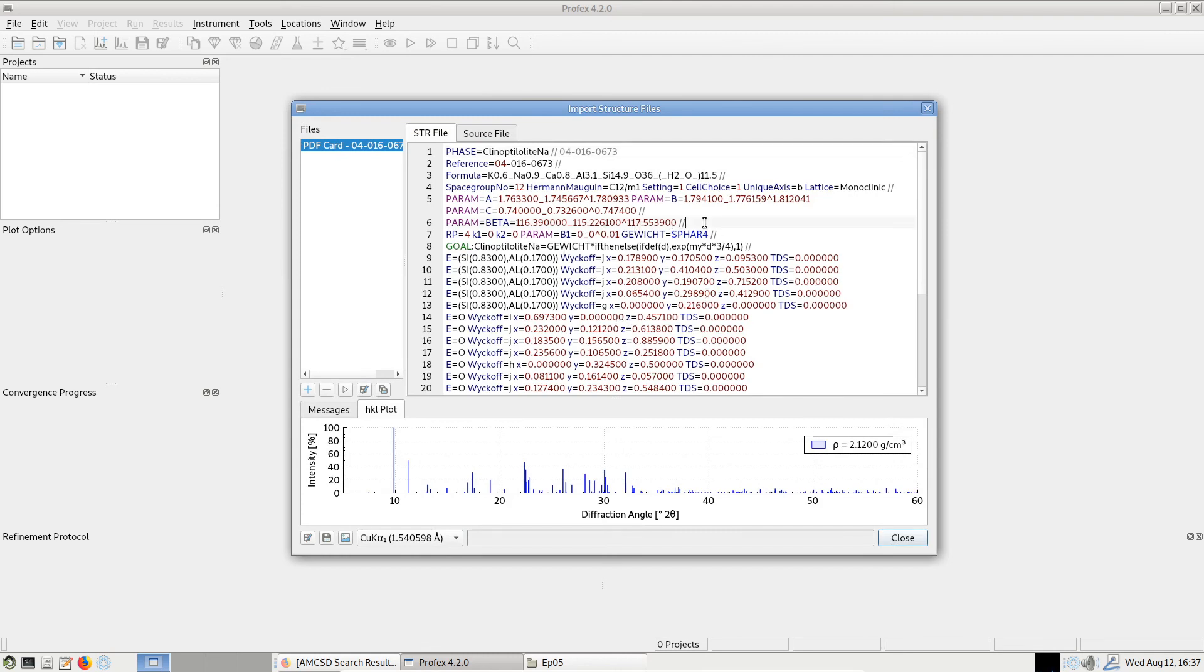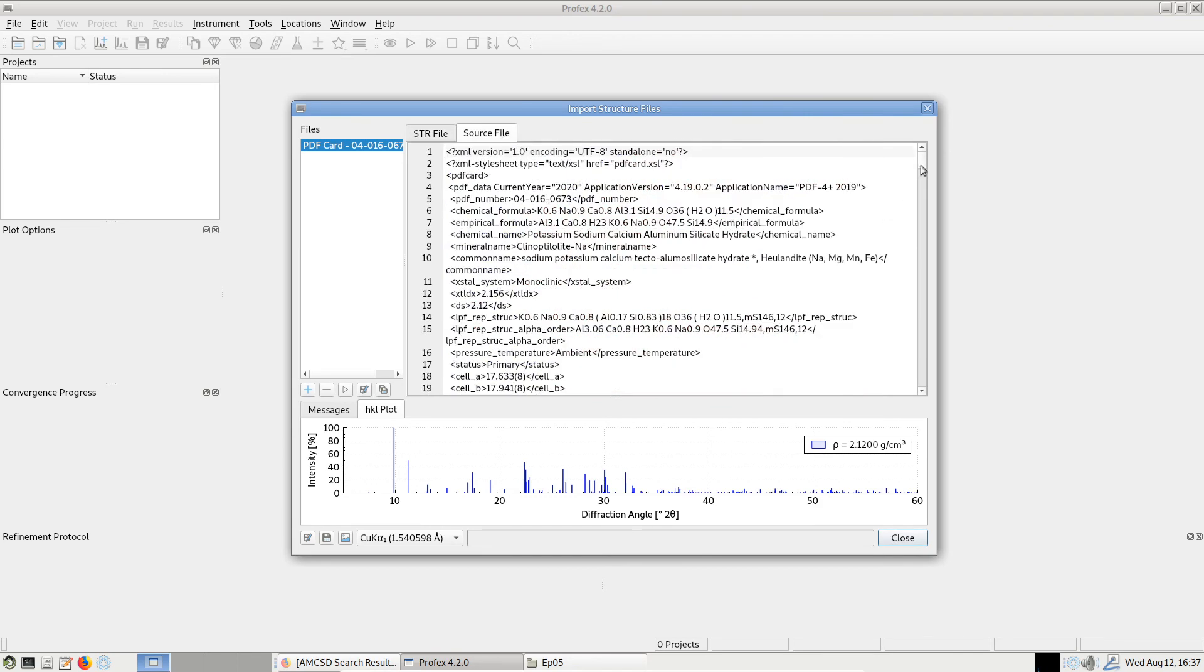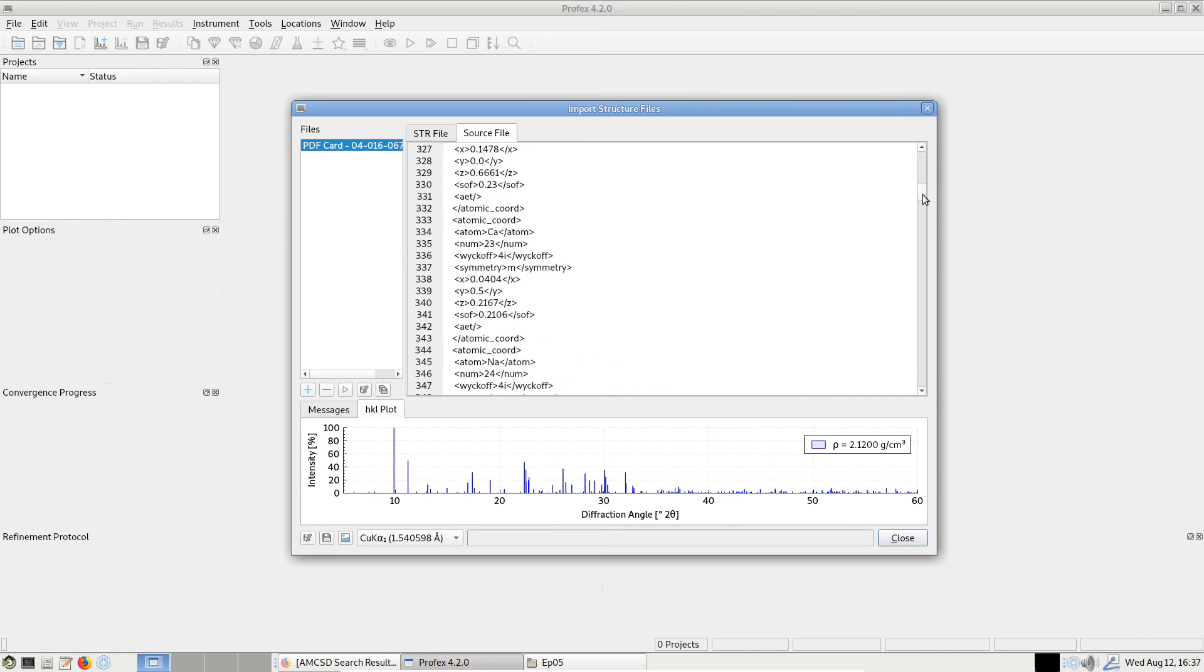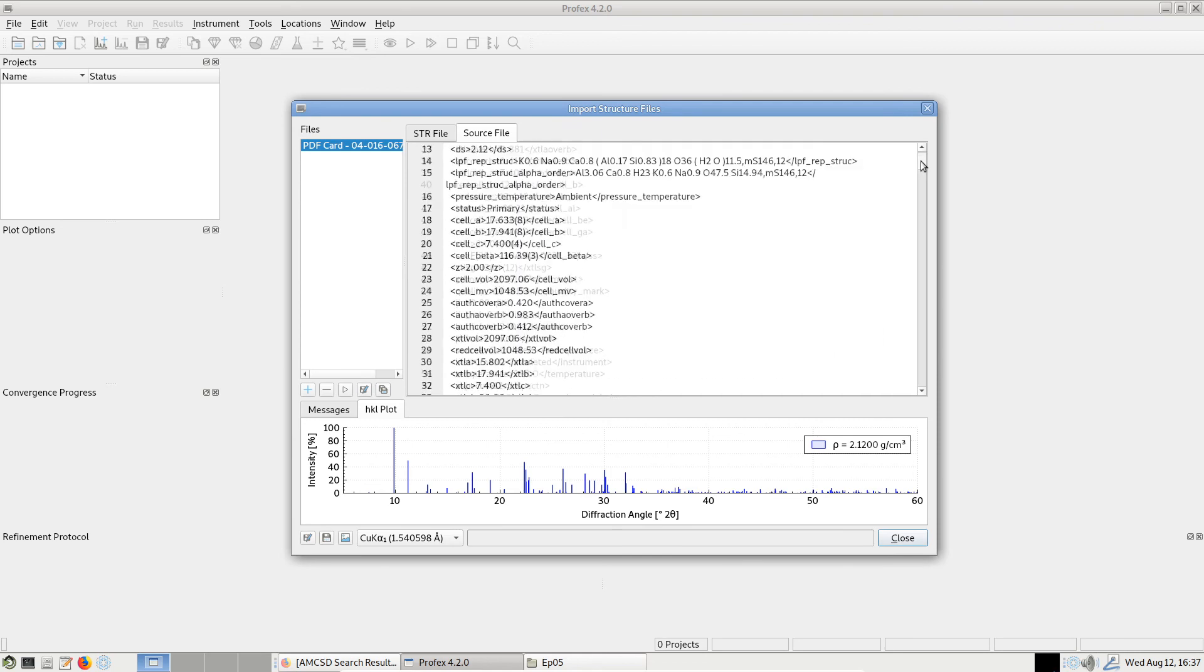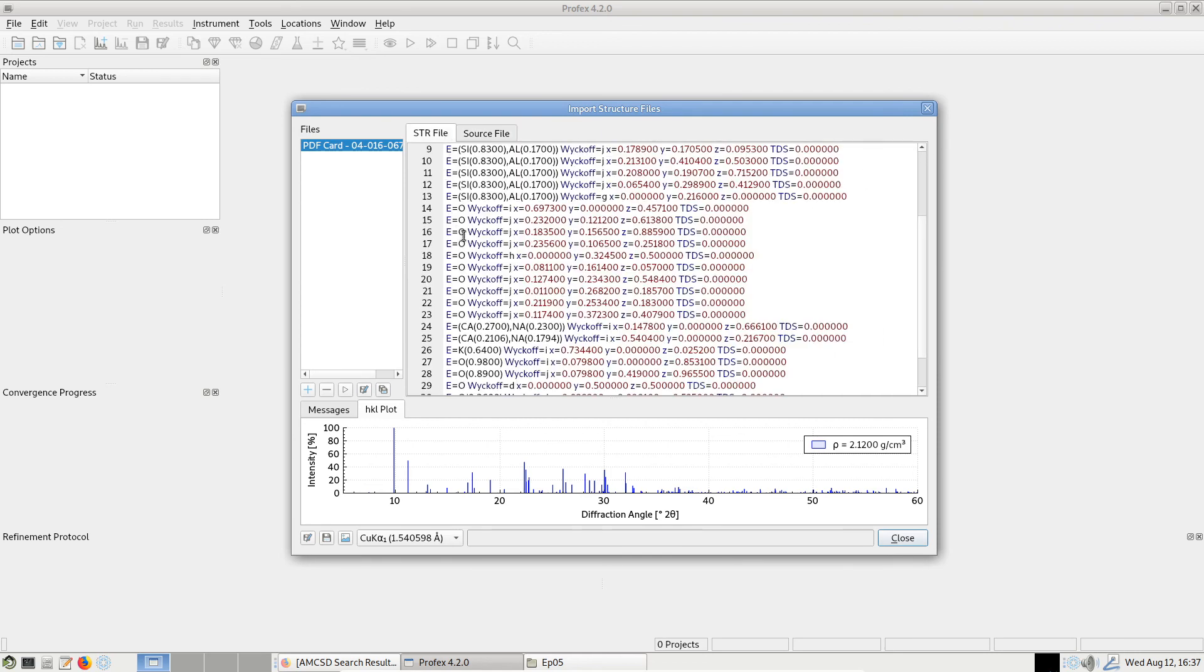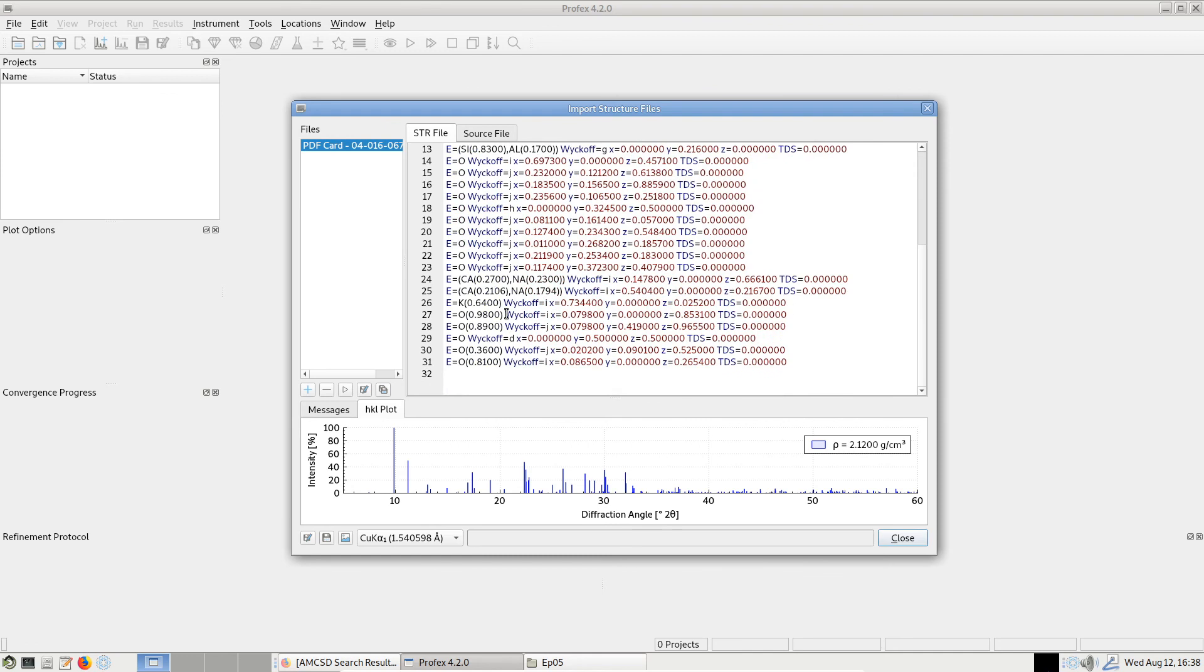And even though it's exactly the same database record, so it's the same published structure as the Kleinoptilolite structure from before, this time we do not get an error message. And if we go to the source file, we see a different structure format. It's an XML file. But this one now contains the Wyckoff symbols for all atomic positions. And now Profex is able to determine the correct setting, setting number one. So we don't have to select it manually as before. And the density is a bit more than two. So also here the water molecules are now labeled with the oxygen symbol. So this time the import was completely automatic.